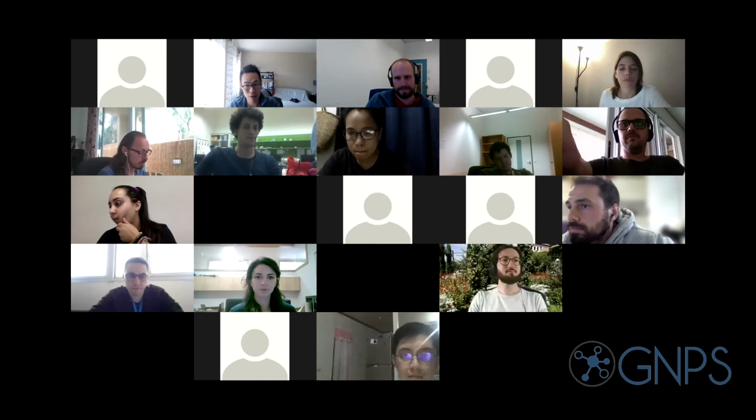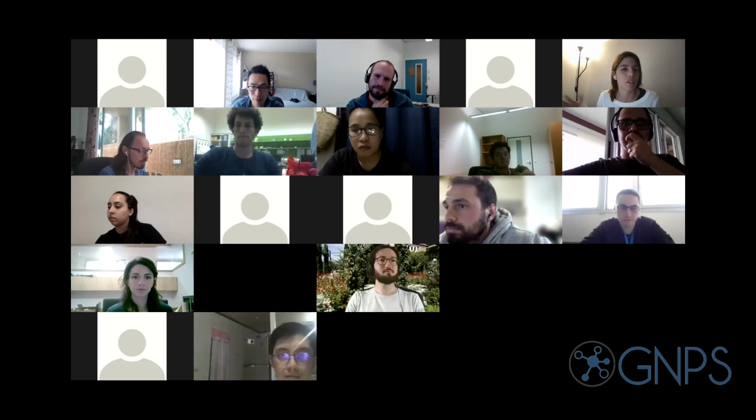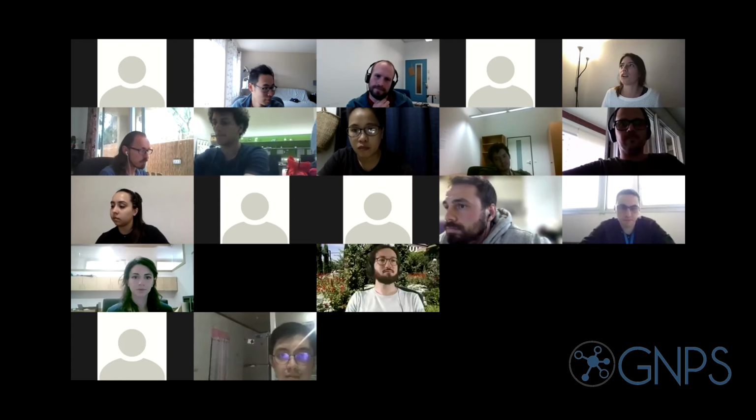But any other questions, fundamental or technical, or just suggestions in general? I have a question again. I was wondering about the feature finding features that you have in there. You have a list of quite a lot of options, but do they all work, or is MZmine right now the one that you suggest? Are you going to add also new ones, like the OpenMS feature finding maybe?